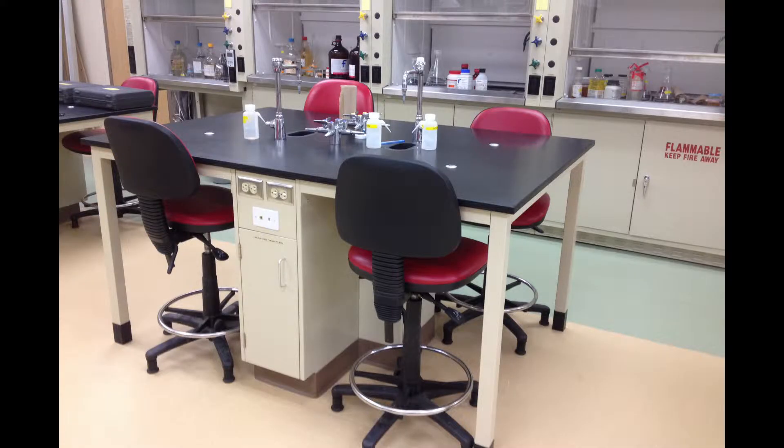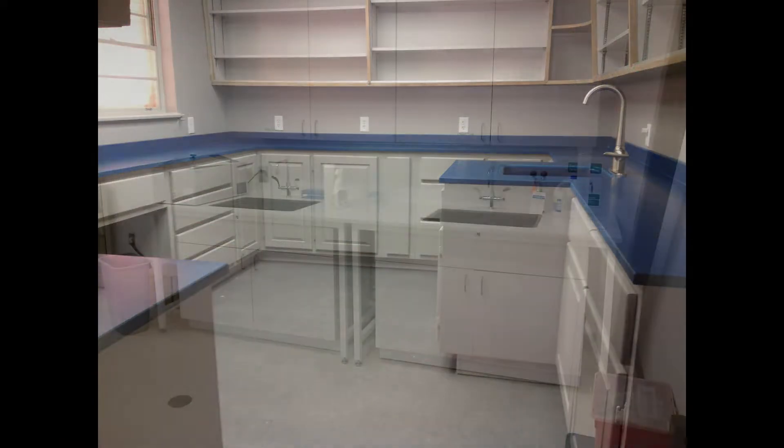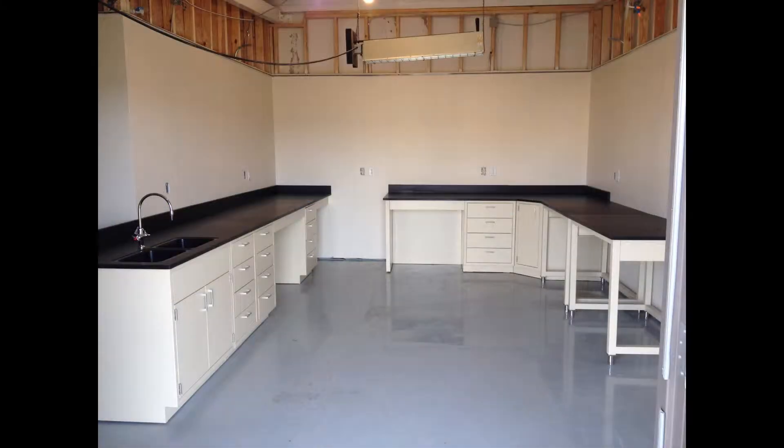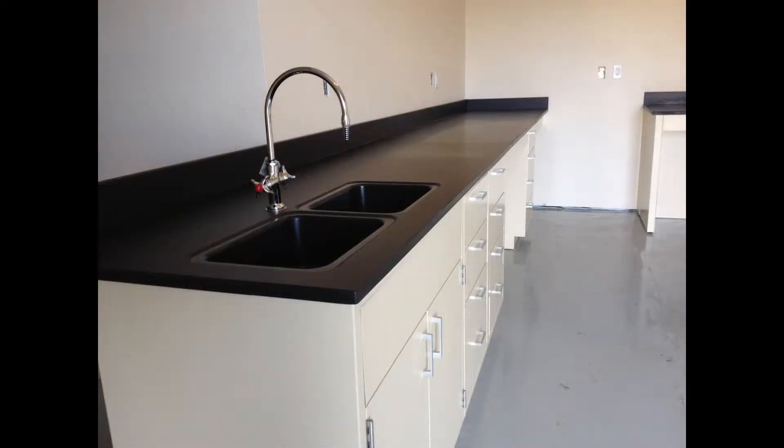Hi, this is Aaron with Chemtops. Today I want to talk to you about our epoxy resin countertops. Epoxy resin countertops are a great solution for environments that are very corrosive or have a high level of moisture. Epoxy countertops are perfect for labs, research facilities, and even commercial and residential areas where harsh chemicals are used.